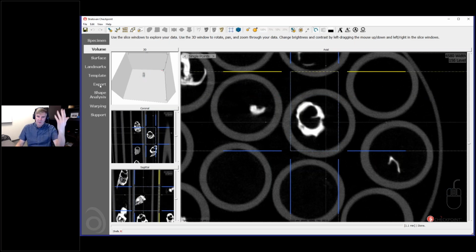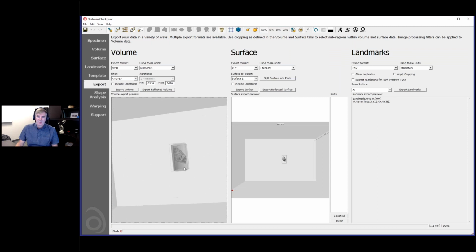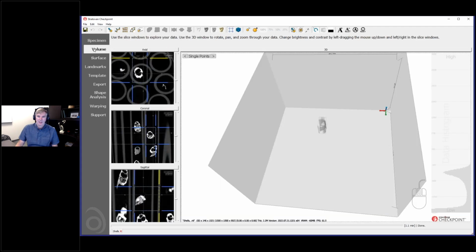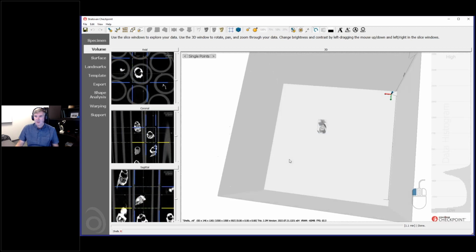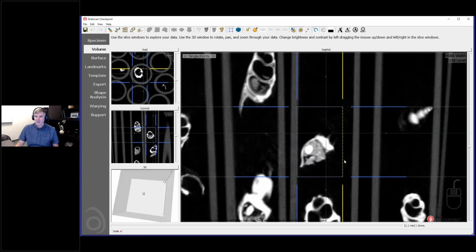export. So to do that, you go to the Export tab. So Export tab, and there's the little region that I can export. And so that's within the crop region. And it looks like we got a little bit too much here. So let's go back. Let's see where that's coming from. Way up here. Yeah, so we bring this in here.